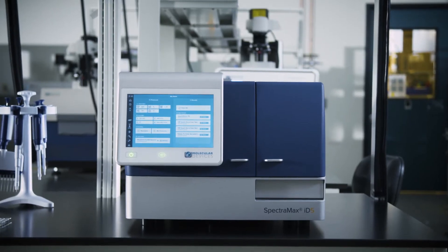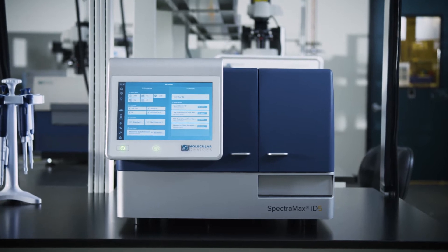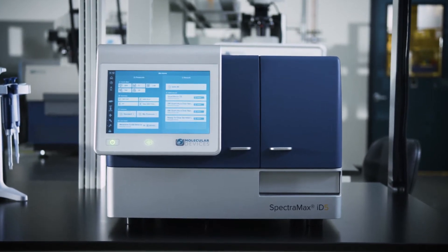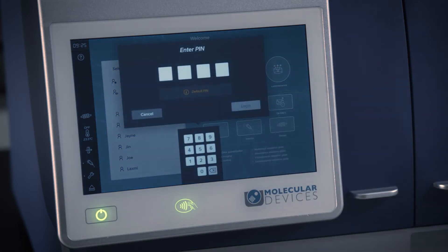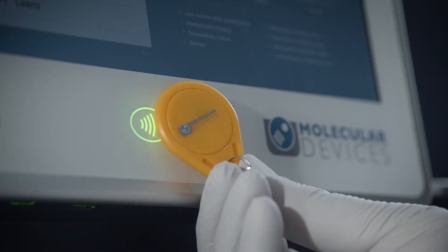With integrated near-field communication technology, the SpectraMax ID becomes the first microplate reader that can recognize you and automatically configure itself to display your protocols and results when you log in with a PIN or with an NFC tag.